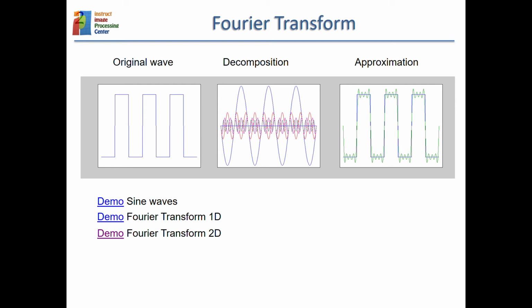And then we have much faster waves like these ones here with a much smaller period, so that means high frequency. Actually, the wave that has the lowest frequency is 0, so that is a constant, the period is infinity, so there is no variation over space. That is the definition of a constant.